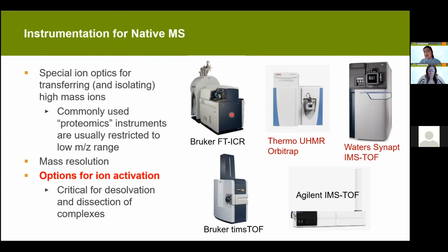And I would say that's probably one of the limiting factors for native mass spec, because that's a variable, and it varies depending on which lab, which protocol you typically follow. But there are also commercial sources you can buy those tips from, and they qualify the size of the tip. It's just more expensive if you do it that way.